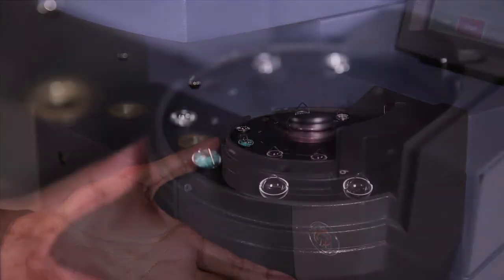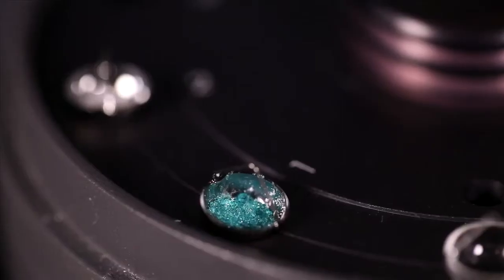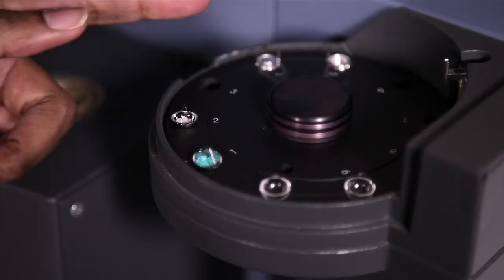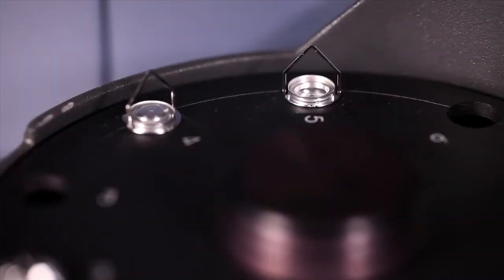The auto sampler can accommodate up to 10 sample pans. Typically, samples are placed in metalized quartz pans. However, you have an option to encapsulate your sample in hermetically sealed aluminum pans, which are punched open just prior to the start of the experiment.